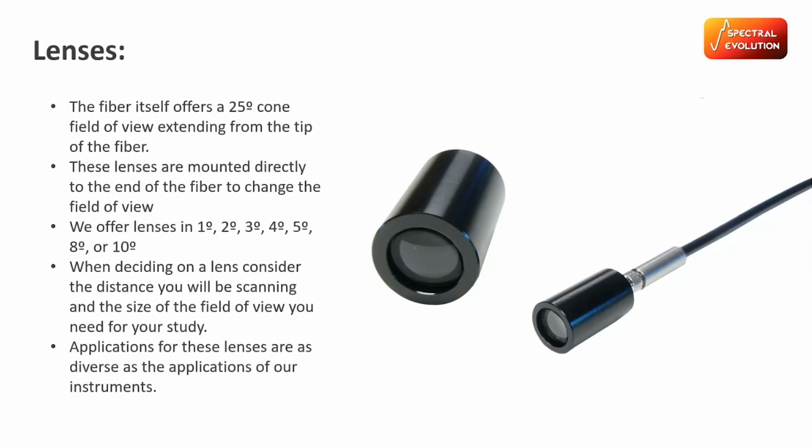So in the field, you would take a reference measurement on a white plate and then take target measurements off of outcrops from waist level or with a pistol grip. That's something that's very effective for characterizing outcrops, ground truthing of remote sensing data as well, and for mineral identification. We have a lot of different averaging tools too to characterize outcrops in real time to speed up acquisition of data.